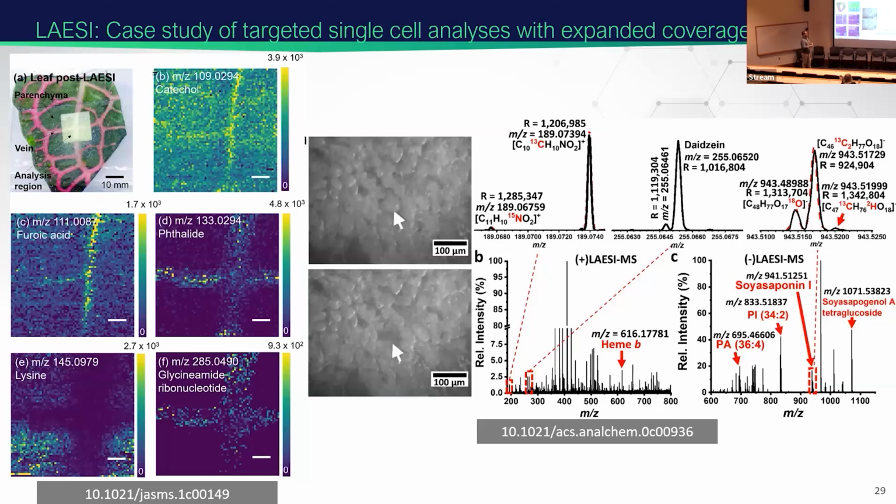biomolecular compounds. This is where we get into single cell analyses, where mass spectrometry imaging gives you these fantastic ion images, which are very characteristic of the morphology and the anatomy, but we can also see how the metabolic profiles change in each of these cells, whether they're infected with bacteroids or just control cells. This can give us a glimpse into how nitrogen fixation is happening, as well as the overall amount of variance that is persistent within these single cells.